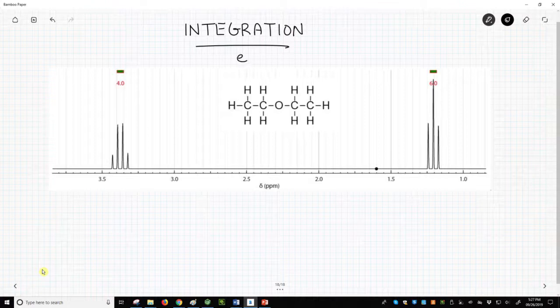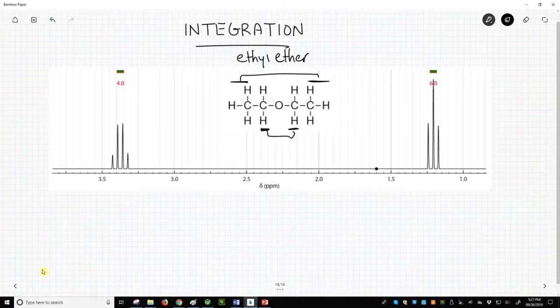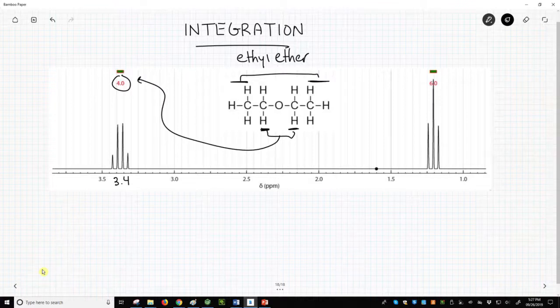Let's look at ethyl ether, a common solvent. This molecule has two different types of hydrogens. The first type consists of the four hydrogens in the two identical CH2 groups. The second type consists of the six hydrogens in the two identical CH3 groups. If we look at the NMR spectrum from nmrdb.org, the signal around 3.4 ppm has a 4.0 above it to indicate four hydrogens. There are four hydrogens from the two CH2 groups. This signal is farther downfield because the electronegative oxygen is deshielding the hydrogens on carbon.